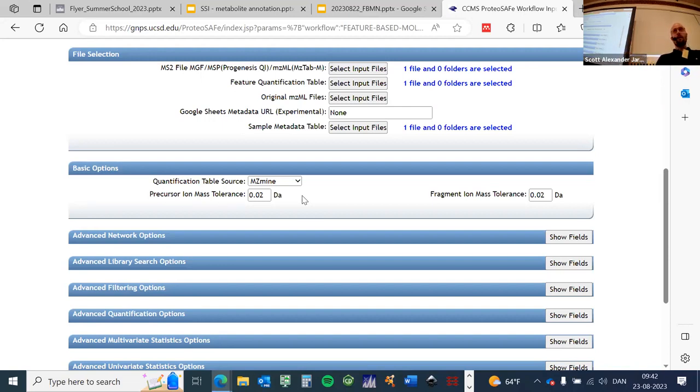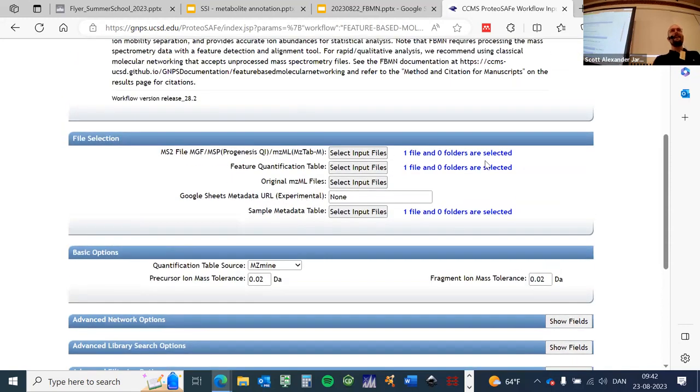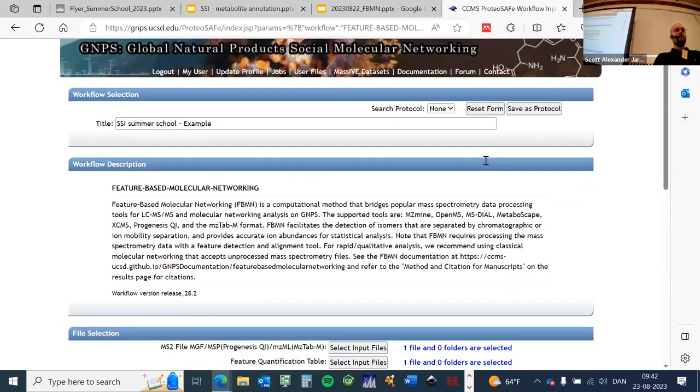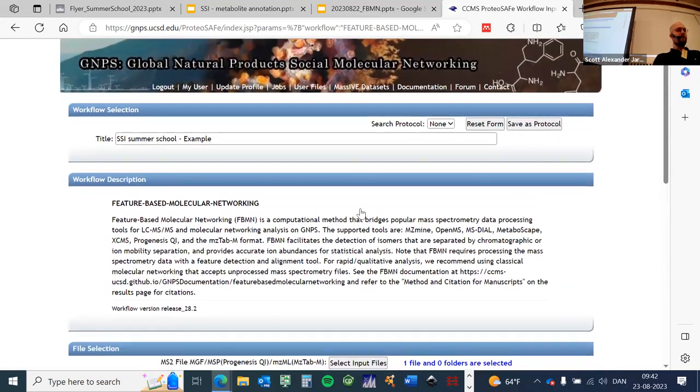Everyone following along? No? Okay. Is it getting the data in? Okay. So let's explain getting the data in. The drag and drop. The files might be too big.